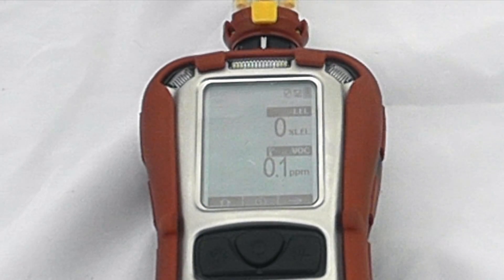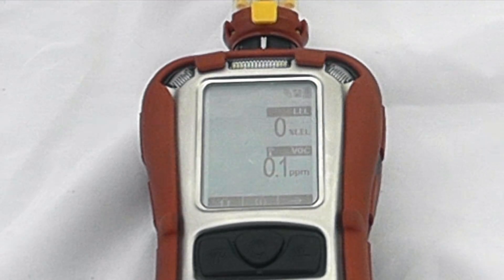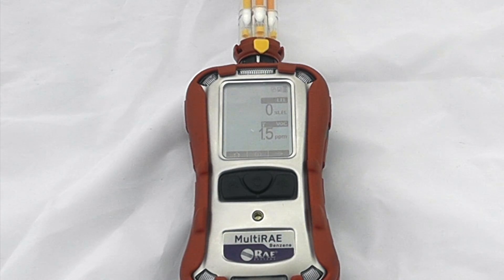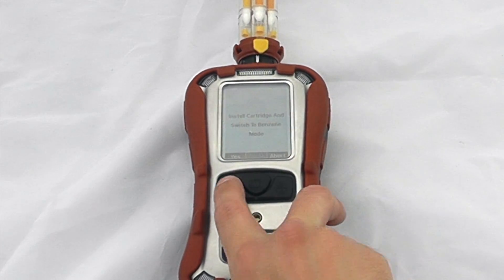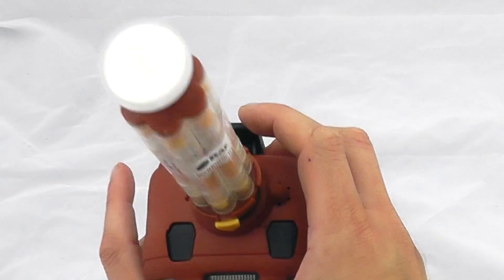If we want to do a benzene-specific measurement, we can use this as a general all-purpose multi-gas monitor and then, say we had a heightened VOC reading and wanted to check for the presence of benzene. To conduct a benzene measurement, we flick into benzene selection mode — scroll across one — and it says 'tube ready, start sampling.' Hit yes. It will say install the cartridge if it's not already installed — that's this top section here — and then switch to benzene mode.